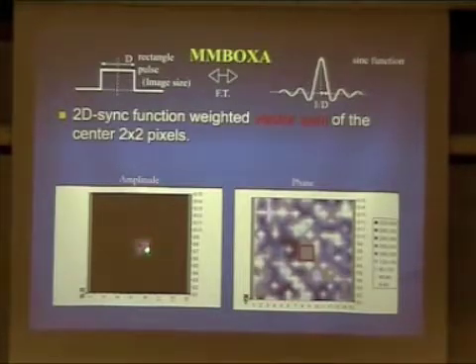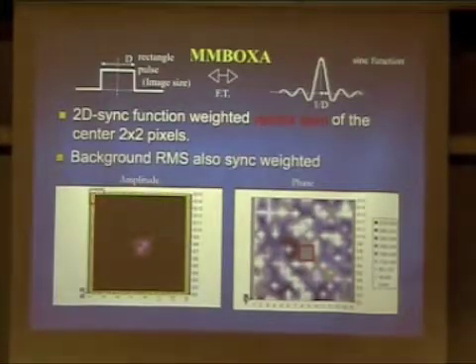So as a result, what you see is the peak in amplitude that has a big variation. One thing to notice is that if you have a sharp peak and look at just the phase within that range, it will have very even phase values. And so that makes the average a bit easier. At the same time, you need to estimate your noise level. The noise level is estimated by doing a similar kind of fitting, but on the border of the boxes, where you assume there won't be any crystal information. Okay?